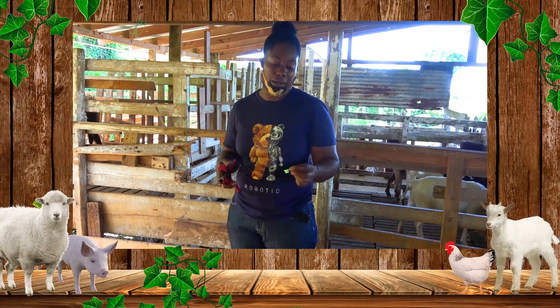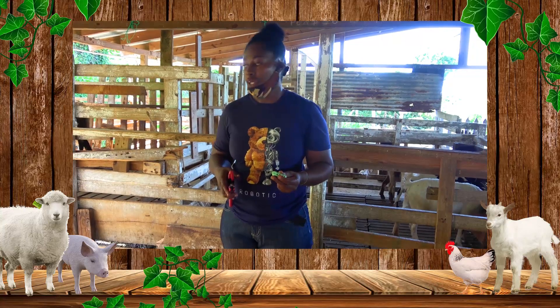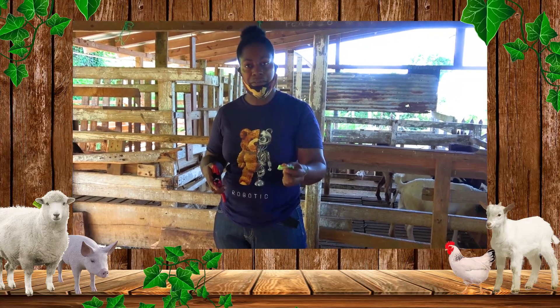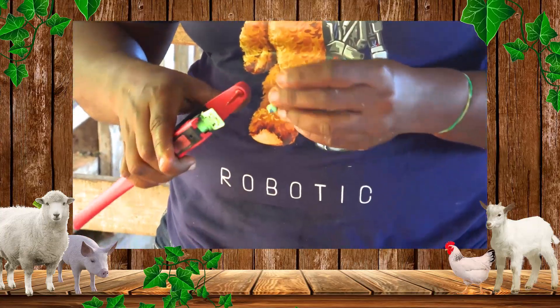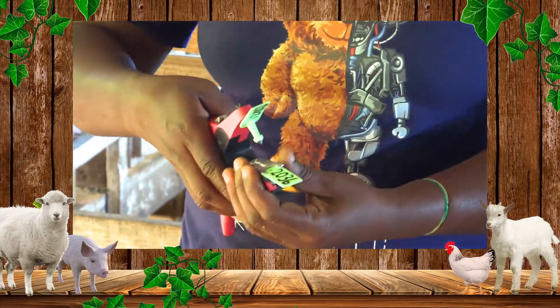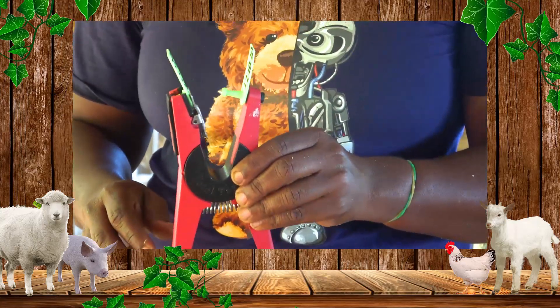The two methods of identification that we use at this unit are ear tagging and ear notching. Today we are going to do ear tagging. We have the female part of the tag — the female goes in — and I am going to place it here, then the male goes above. We have it like this and then we are going to tag the animal.